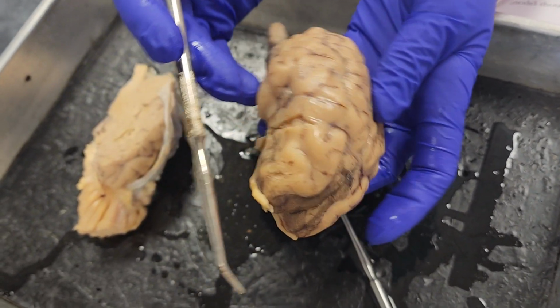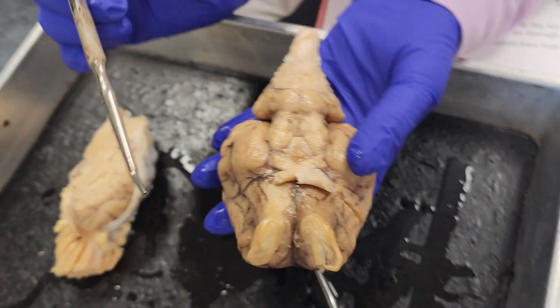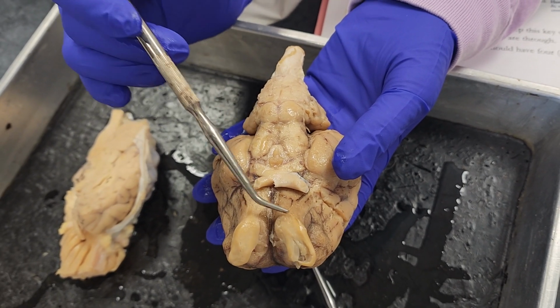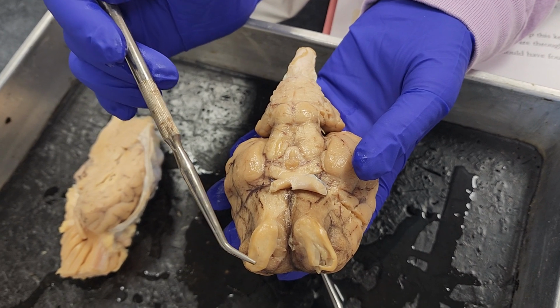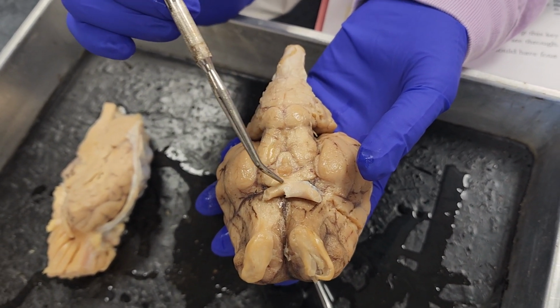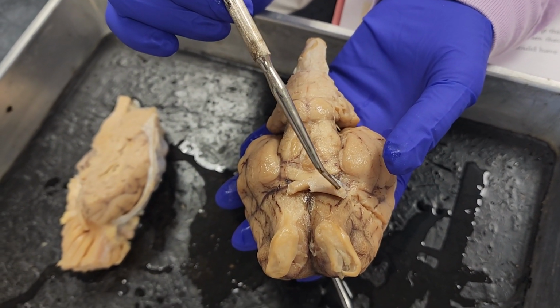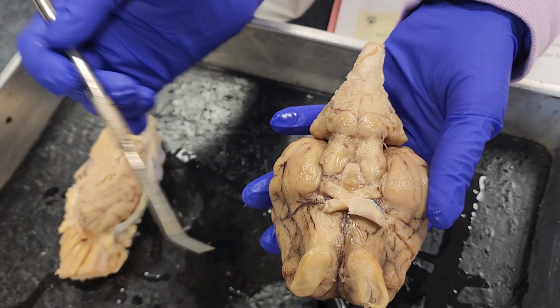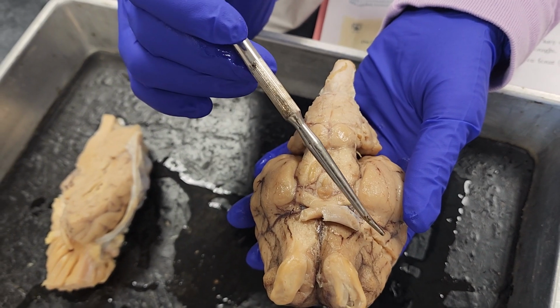When we flip over, this is the ventral aspect of the brain. These bulbs right here are called the olfactory bulbs. Olfactory, they're designed for sense of smell input. This X-like structure is made up of the two optic nerves. This is the right optic nerve. This is the left, because we're coming in from underneath the brain now. So this is from the left. This is from the right eye.